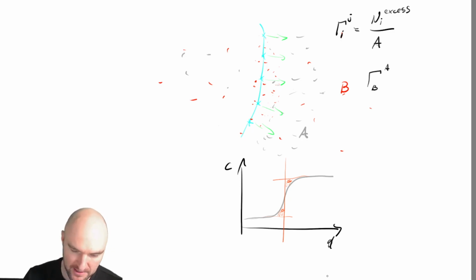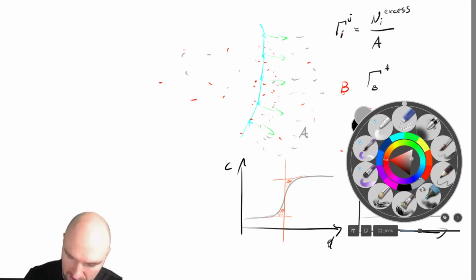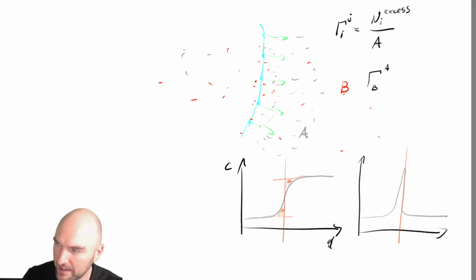On top of that is the whole business of, just imagine that being a grain boundary. If it's a grain boundary, a concentration profile would look like this. Where would you find a point where this is true in a grain boundary? Where the sum of these two is 0. There is no such plane in the grain boundary. It doesn't exist. So a grain boundary is not a Gibbsian interface to begin with. Of course, a grain boundary is an interface, but it's not a Gibbsian interface.